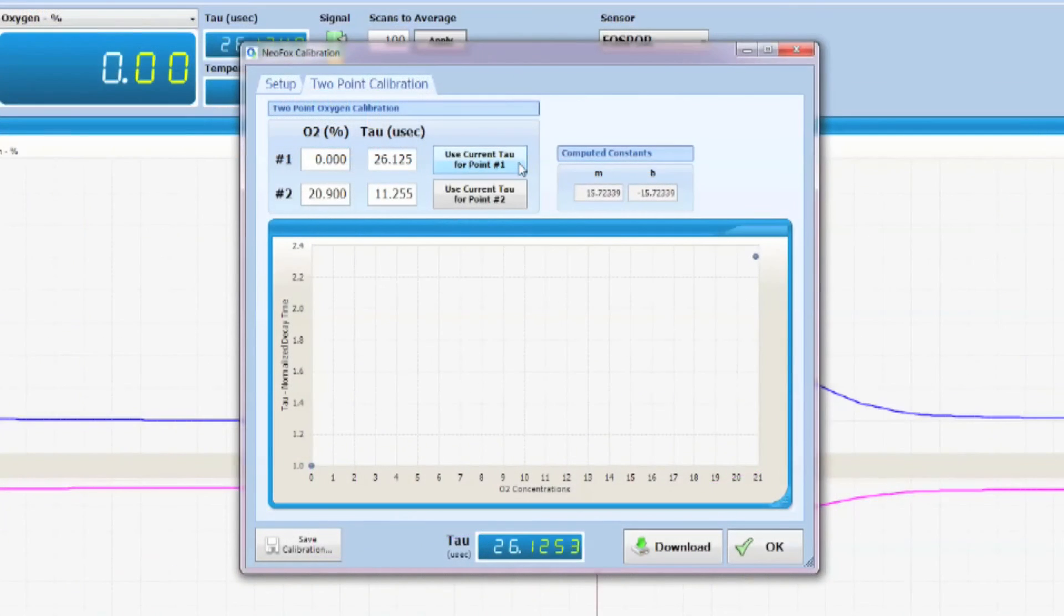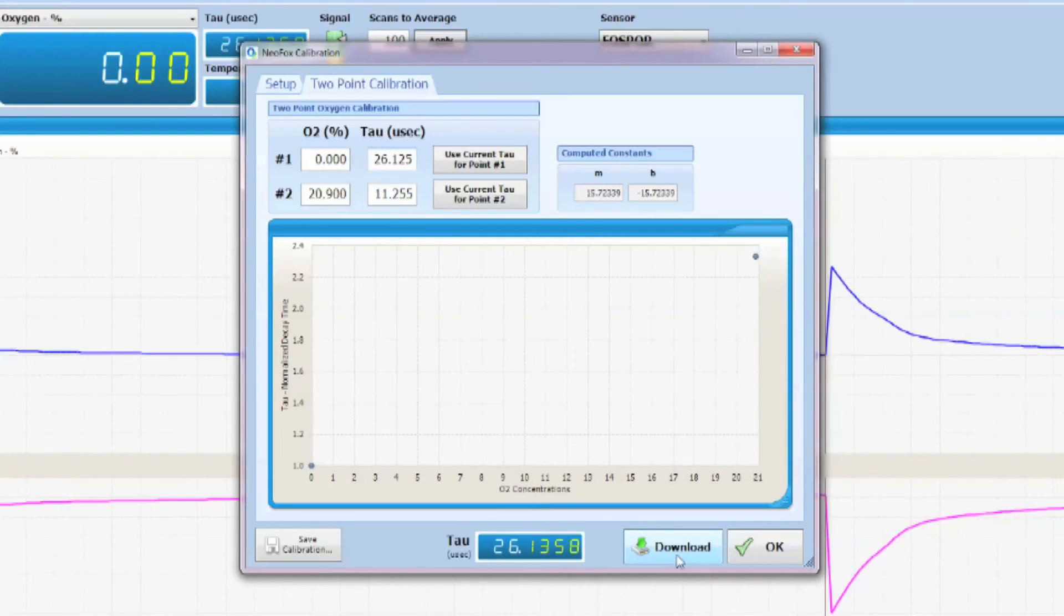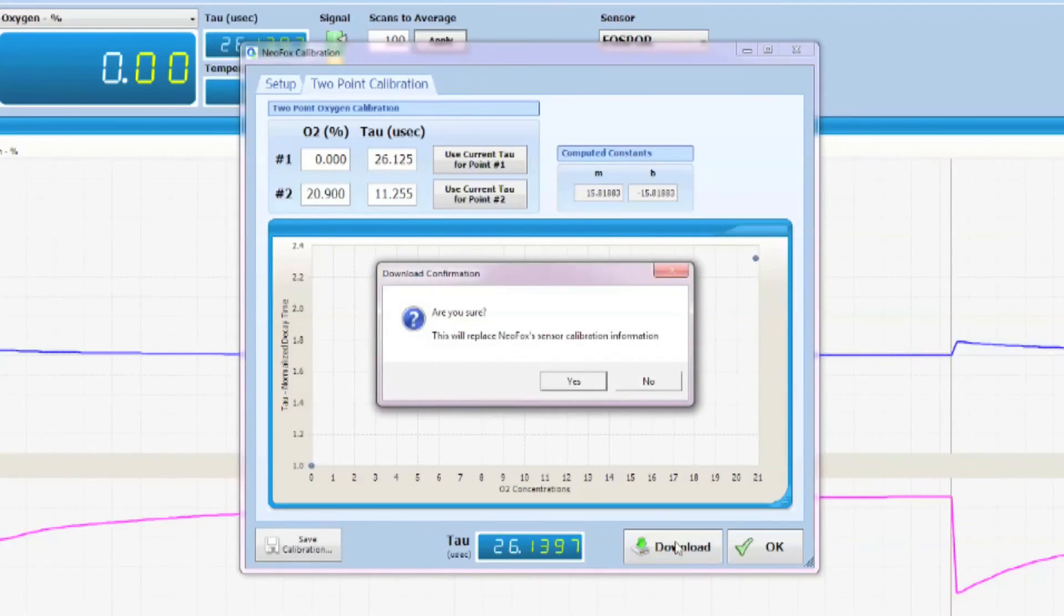You now have your two liquid phase calibration points, and you can click on download. From there, the same box will open asking you to confirm this change. Click yes.